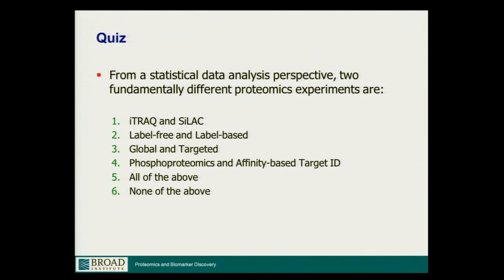Targeted is what Hasmik mentioned yesterday, where you do an MRM-MS analysis. You know the exact proteins or peptides that you are interested in, and you set up assays to look exactly at those in your sets of samples. In a targeted mass spec experiment, the important thing is to properly set up the assay, qualify it, and understand its characteristics. How good is it? What are the limits of detection? Is the response linear as the concentration of the protein you're trying to measure increases? So you want to characterize the assay first in a targeted experiment.